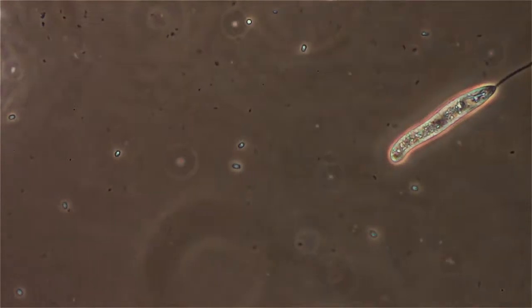I don't know what the little tiny things are. Not bacteria, though.